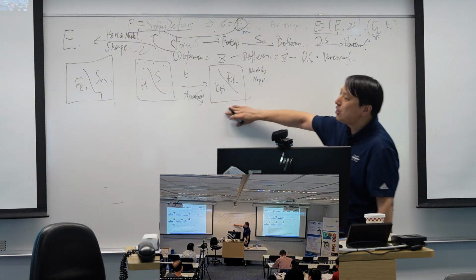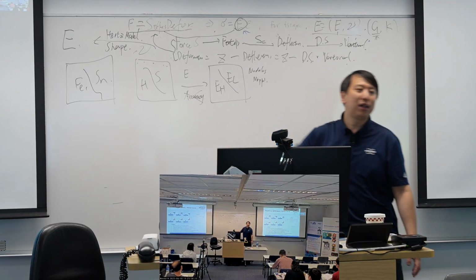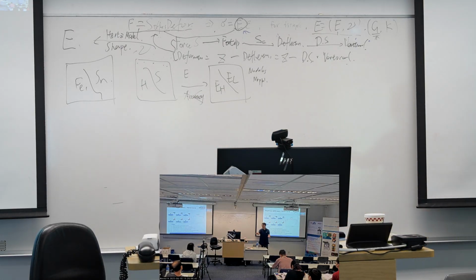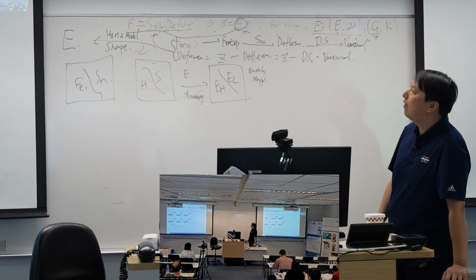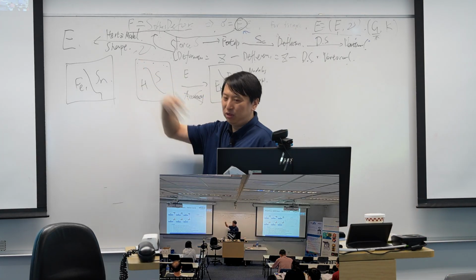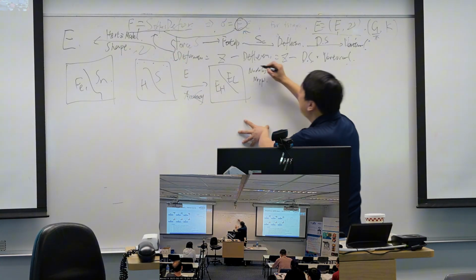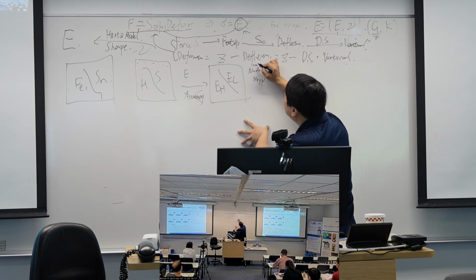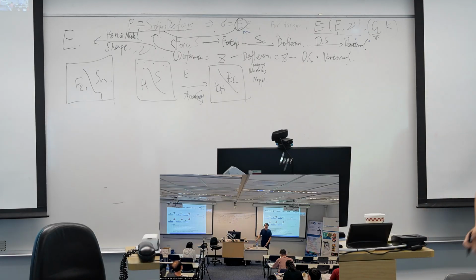So in such a case, you don't need the accurate calibration. You can just type in a certain value provided by the manufacturer or the software, and for the tip shape, nobody cares. Just type in any value, and you get an inaccurate modulus mapping, but it does not matter. It still gives you which part is hard, which part is soft.